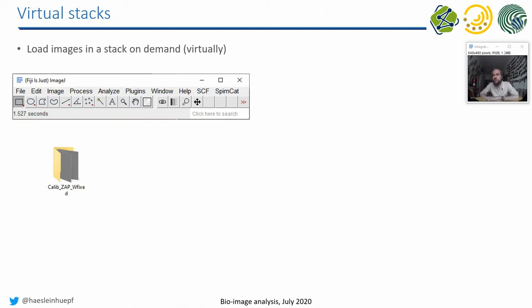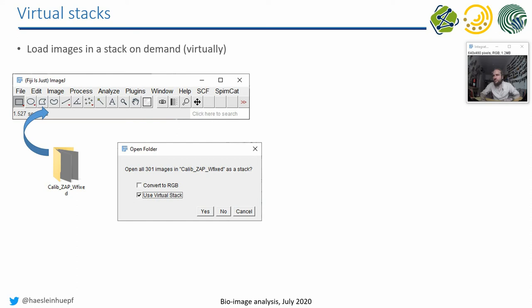A virtual stack is basically a stack which is loaded on demand. It just loads the part of the data which is necessary to look at the particular time point or z-plane you're viewing at the moment. You take your original folder, drag and drop it on ImageJ and Fiji, and activate this checkbox here.